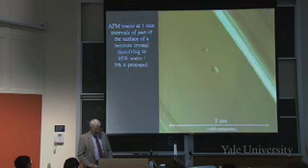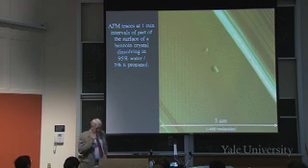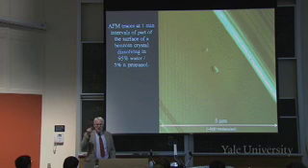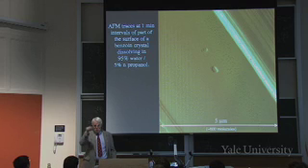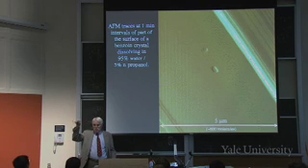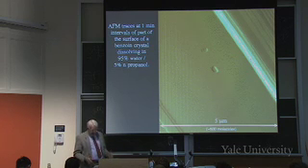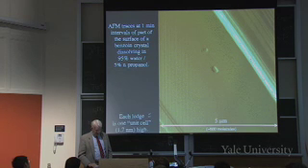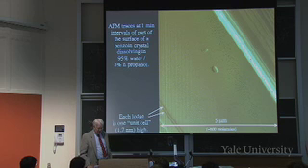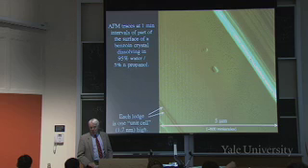Easy. Here's, in fact, a picture taken by an undergraduate. In fact, it's a movie. So it's AFM traces. So what you do, it's like a TV, you know, where you go zoom, zoom, zoom, and then you go back to the top, zoom, zoom, zoom, say how high it is at every point along the scan, and then color code it to show how high. So the width of this is about 600 molecules, right? But the lines you see, which are ledges that go up and down, each of those ledges is one unit cell, 1.7 nanometers, one set of molecules.